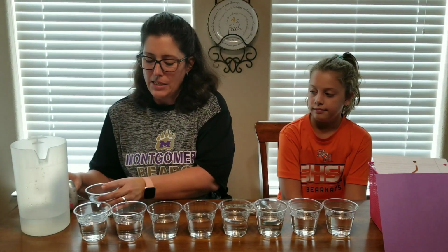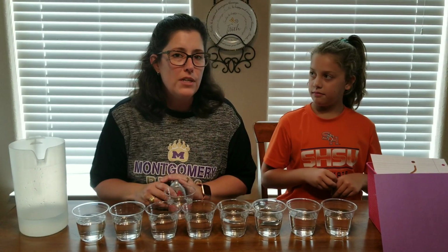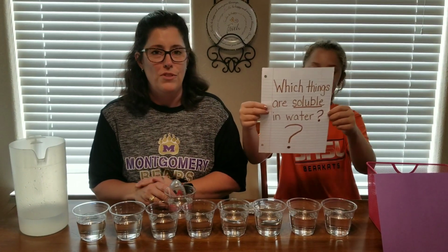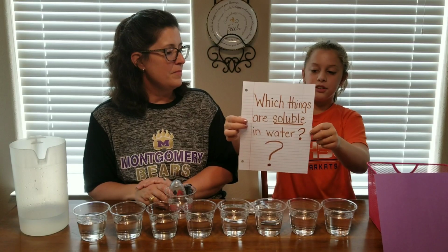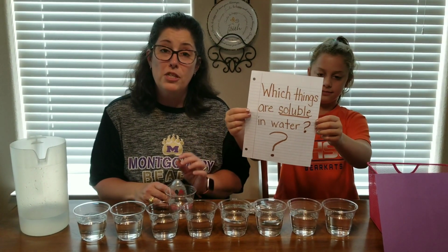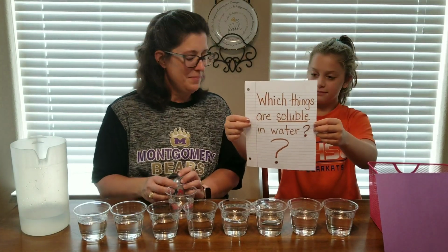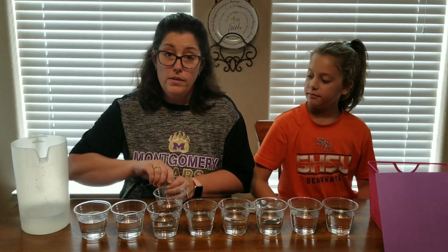So to get started, whenever we do an experiment, we always have to come up with a question first. So my lab assistant is going to share the question with you today. Which things are soluble in water? So that just means which things that we're going to experiment with dissolve in water. Thank you, assistant.